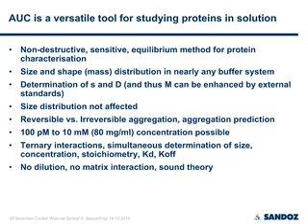You can discern reversible and irreversible interactions, and you can predict aggregation by using the second Virial coefficient. You have a large concentration range accessible, up to 80 mg per mL, using 3 mm centerpieces in the interference optics. You may want to have a look at ternary interactions, which is difficult, for example, by SPR. You can simultaneously determine size, concentrations, stoichiometry, KD, and K off in one sample. And you have no dilution, as I said, no matrix interactions, and a really sound theory for over 80 years now.